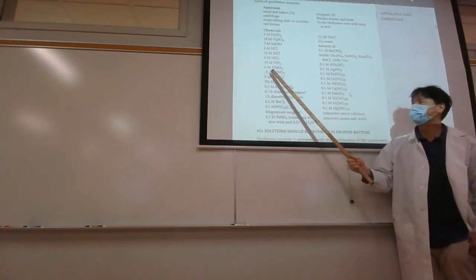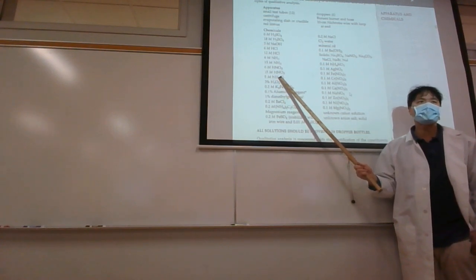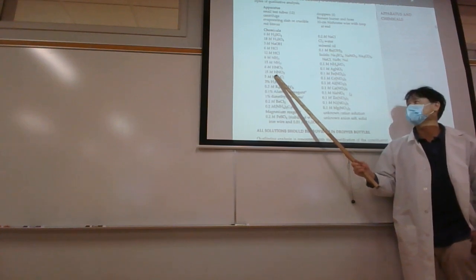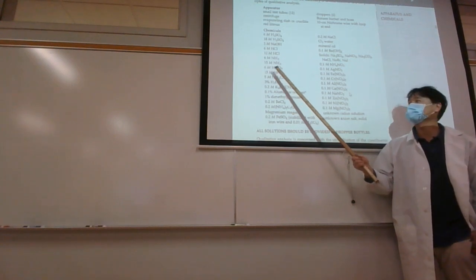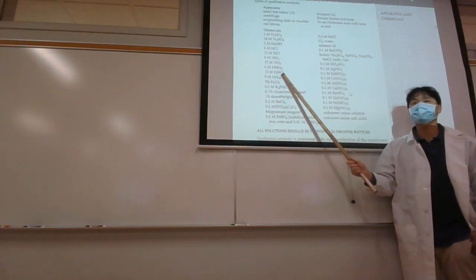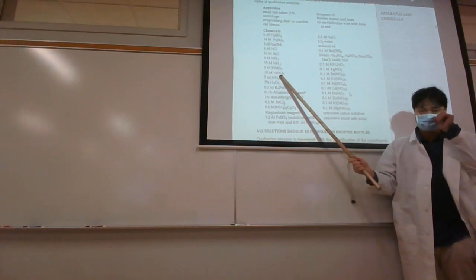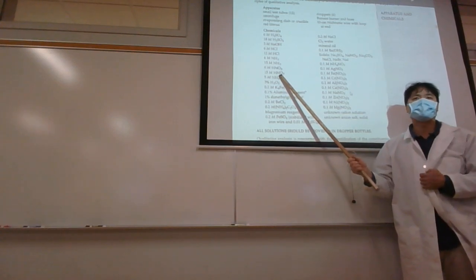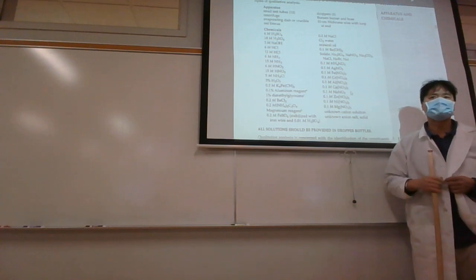6 molar nitric, so we're using dilute and concentrated nitric. Concentrated nitric, you got to watch out. It's a powerful acid, and the powerful acid is going to cause burns, but this one is also a powerful oxidizer. It's not flammable, but it could cause things to burn.